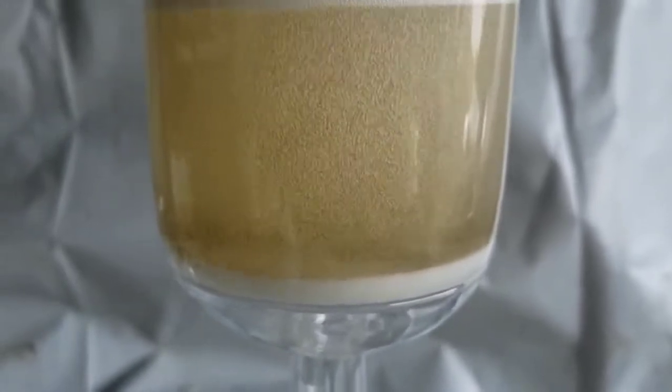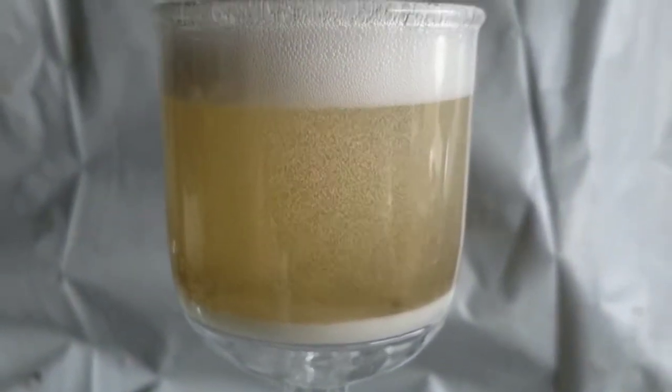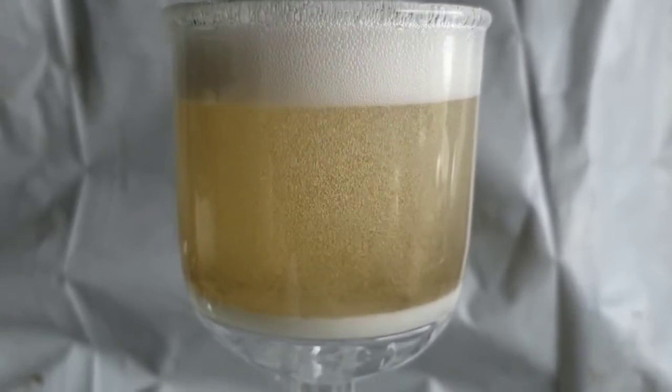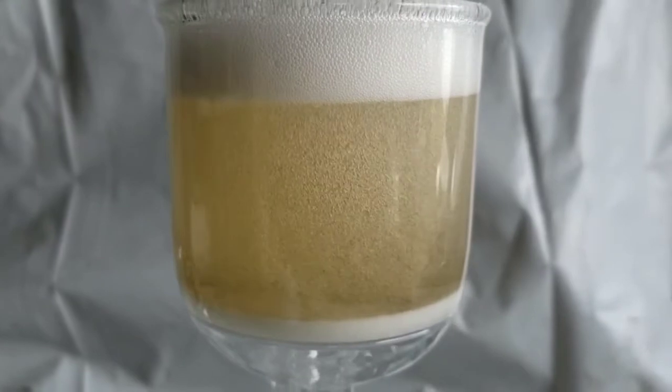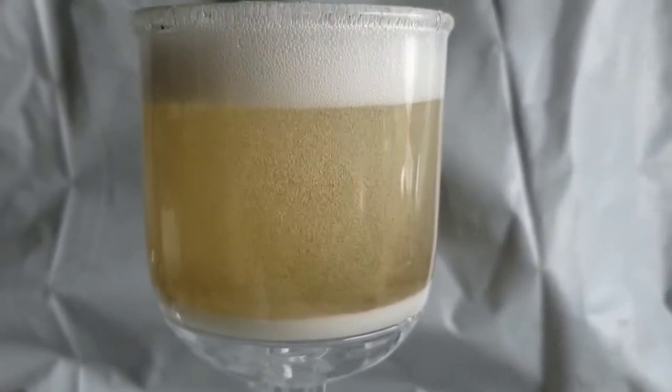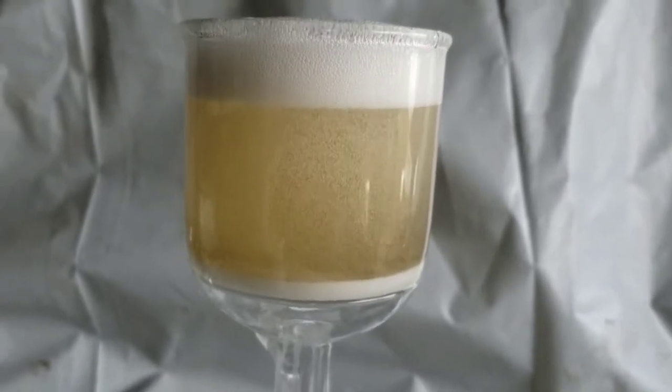It's oxidizing it into carbon dioxide. The same thing would happen to a diamond if I threw it into the piranha solution. That diamond, which is mostly carbon, would be converted into carbon dioxide.